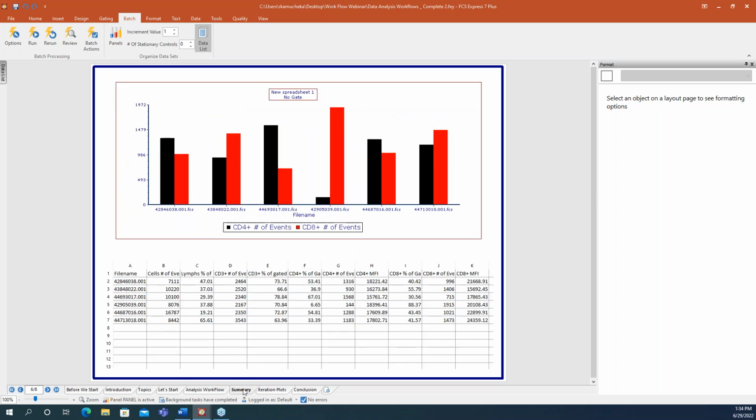And we're going to talk about summaries. So here I'm going to introduce one of my new favorite features also, the ability to batch process into an internal spreadsheet. This is really great for, again, keeping those iterations active and still being able to use summary plots like bar charts, pie charts, and other things. So how do we do this?